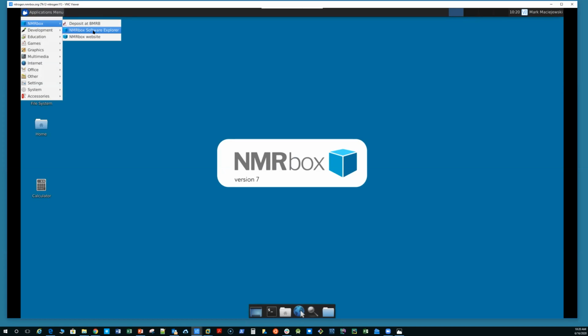In the past, we've had a variety of software packages, mostly GUI-based applications, in this menu bar. And NMRbox has over 200 packages with, I think, over 10,000 different binaries that can be executed. So trying to generate a typical launcher menu that you would see in Windows or an Apple computer, that users are normally accustomed to, becomes a daunting challenge.